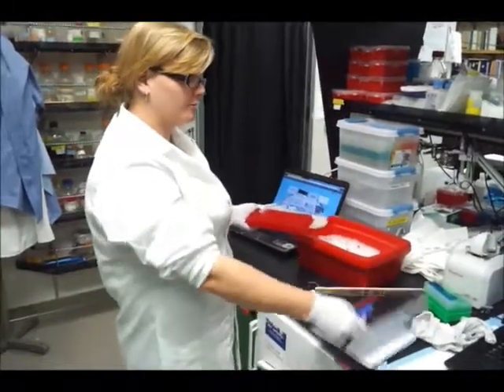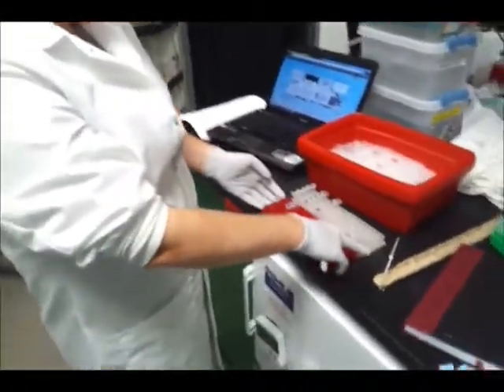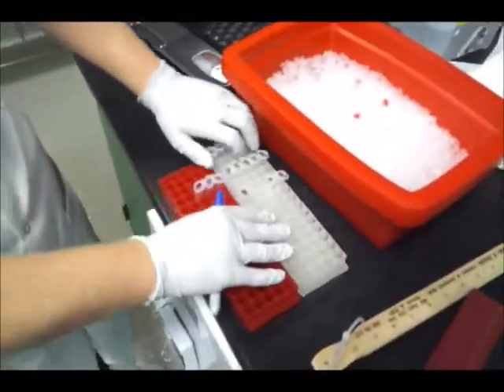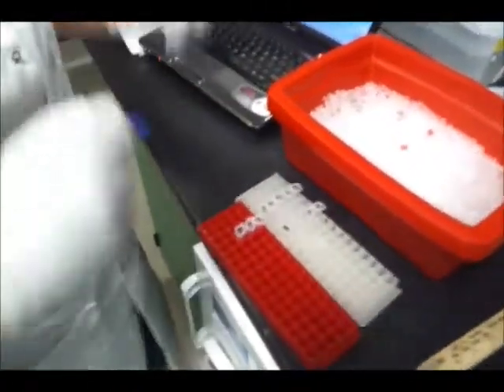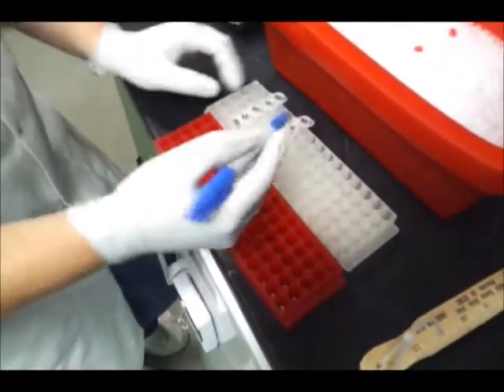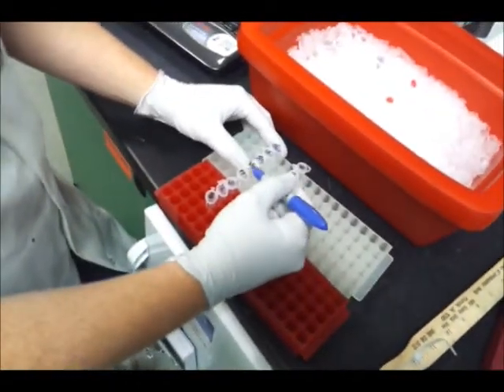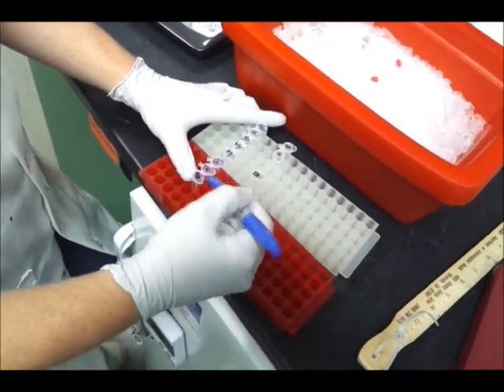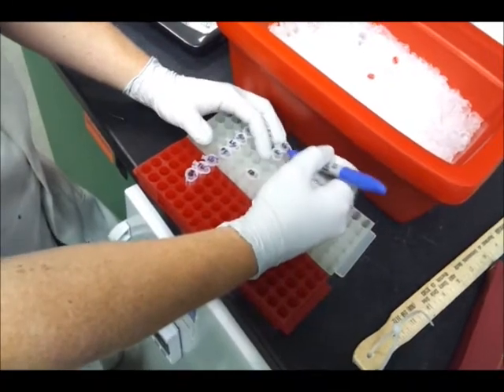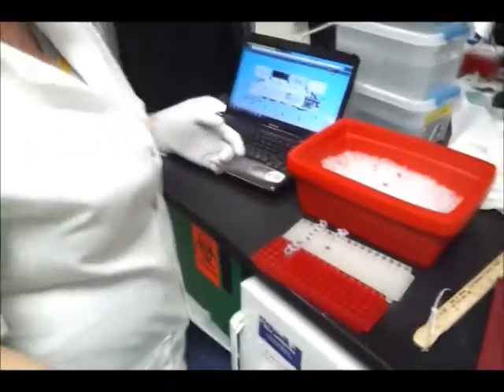Cleaning up after your qPCR run, and you're hoping for everything to be epic. And the standard solutions are meaningless now because you're not going to use them again. So these guys get thrown out. I'll find the trash in a minute. But these DNA samples, you're gonna want to hold on to them. So just put like a little tick mark so you know that they've been used and that they don't have 10 microliters, that they probably have at best 4. And then you just put them back into their freezer box, into the -20.